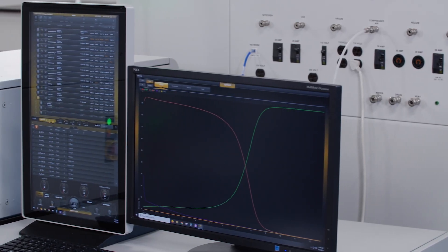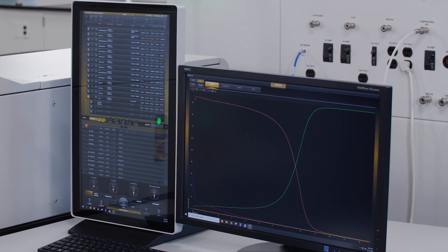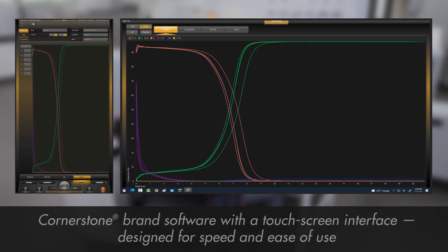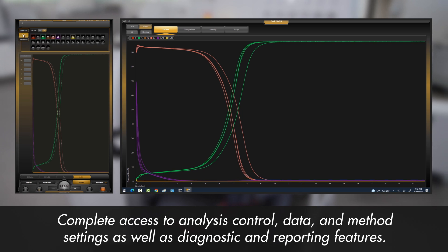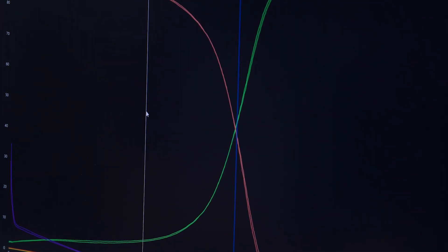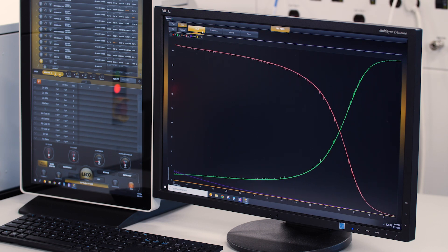The GDS systems feature our exclusive Cornerstone brand software with a touchscreen interface designed for speed and ease of use, which allows you complete access to analysis control, data and method settings, as well as diagnostic and reporting features. These features come together to provide an overall advancement in optical emission analysis, enhancing the performance of both process control and R&D applications.